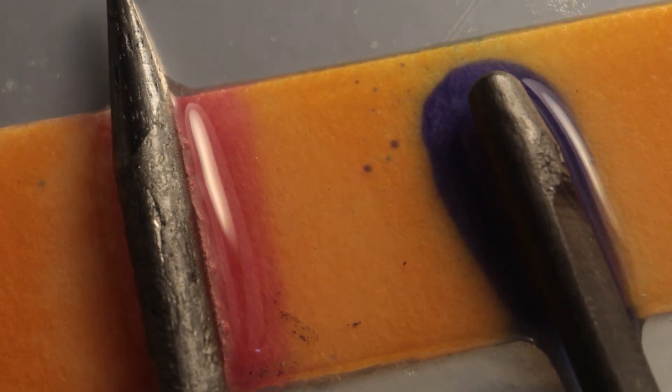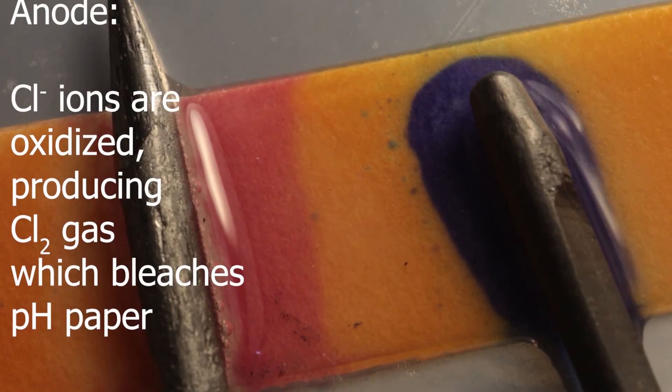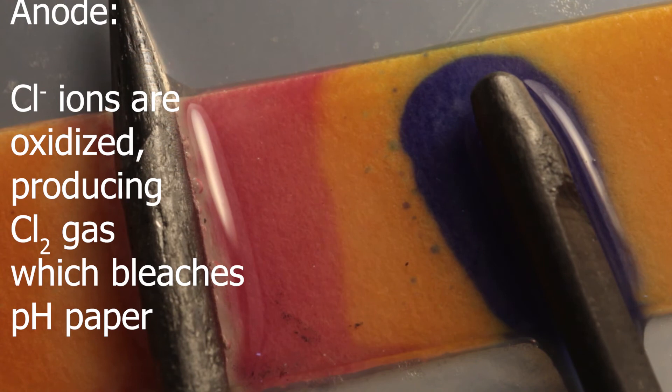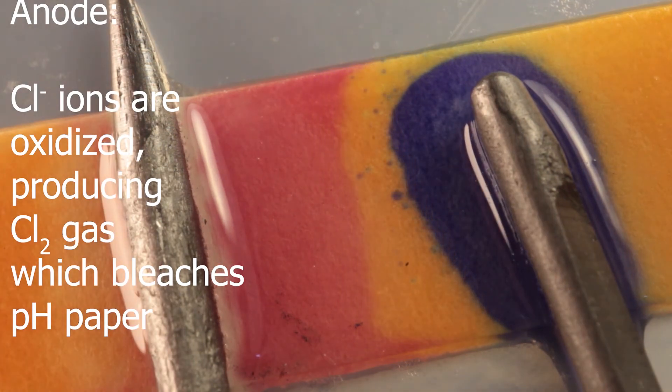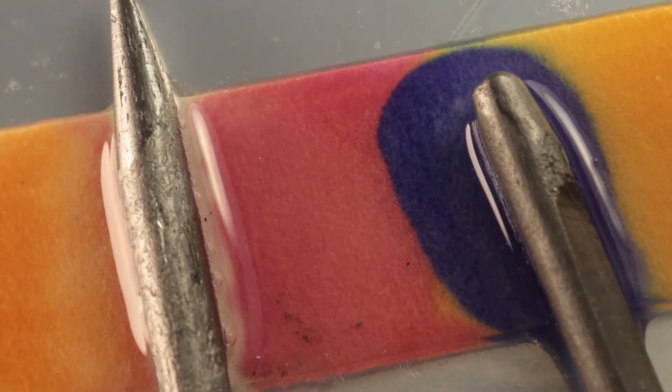At anode, electrons are taken away from chloride ions. Chlorine is formed, which dissolves in water, reacting with it, making solution acidic. And test for chlorine is bleaching of indicator paper.